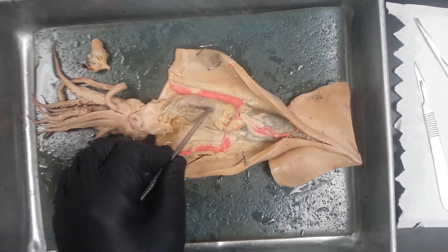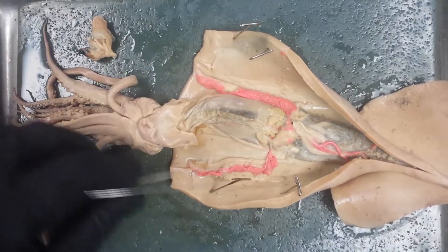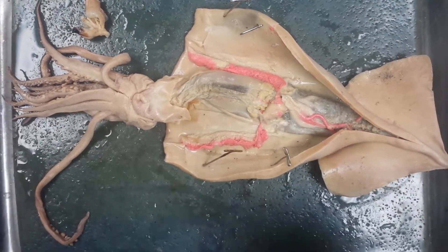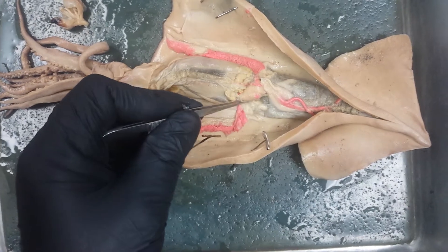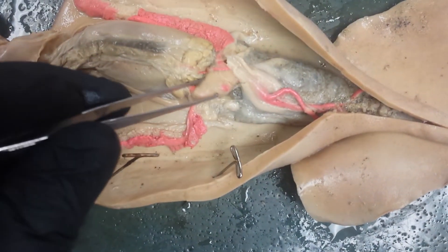If we look closely, we find an ink gland or ink sac right here. We have pink gills on the left and right sides. If we follow the gills up just a little bit, we can see a sac right there — that's a branchial heart. And then here's a systemic heart right there.